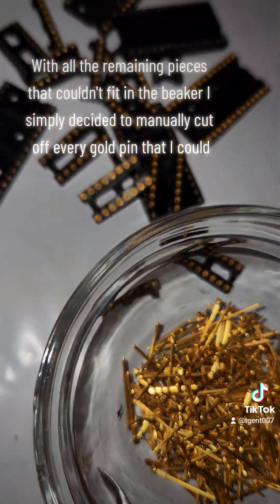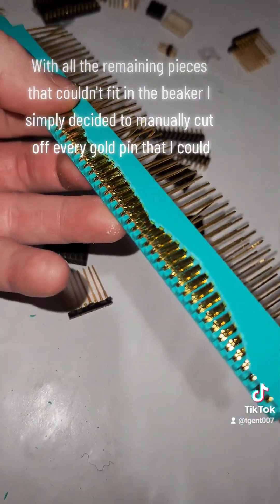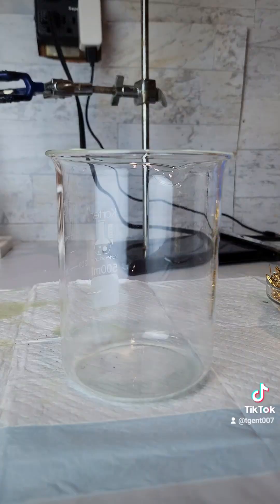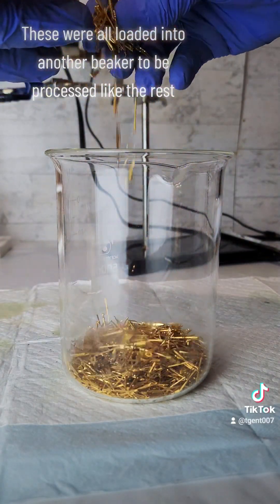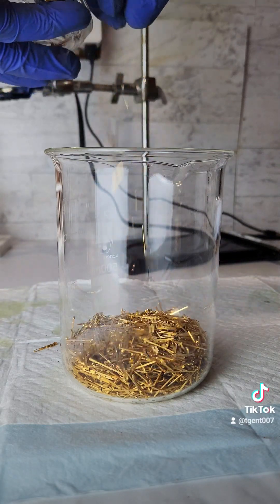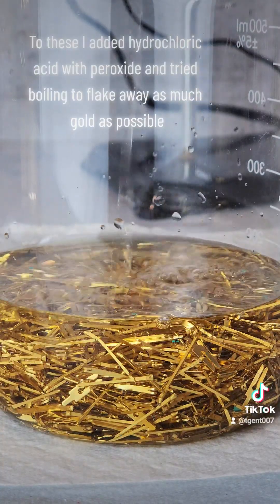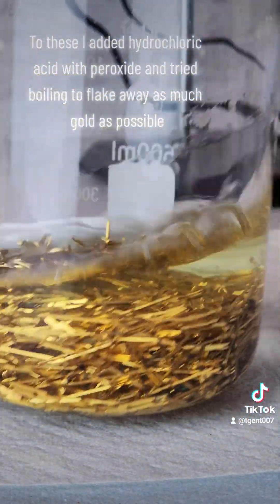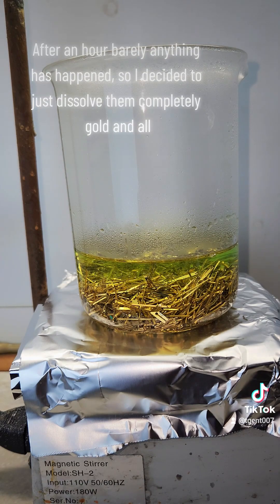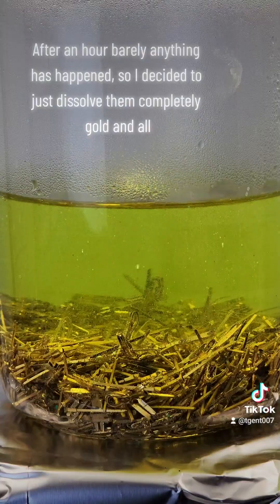With all the remaining pieces that couldn't fit in the beaker, I simply decided to manually cut off every gold pin that I could. These were all loaded into another beaker to be processed like the rest. To these, I added hydrochloric acid with peroxide and tried boiling to flake away as much gold as possible. After an hour, barely anything had happened, so I decided to just dissolve them completely, gold and all.